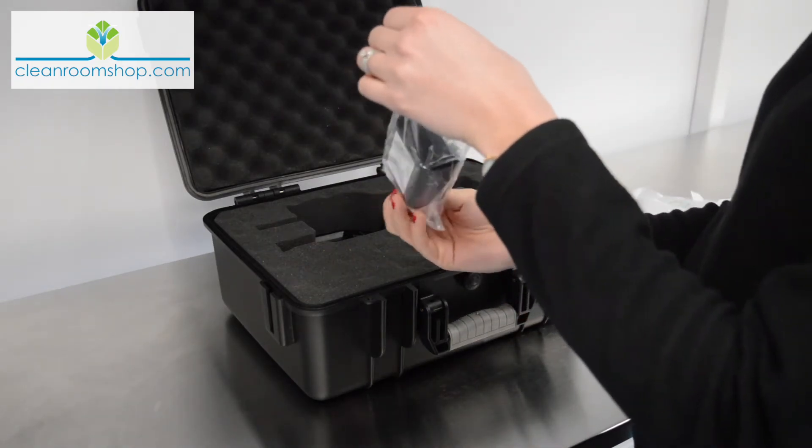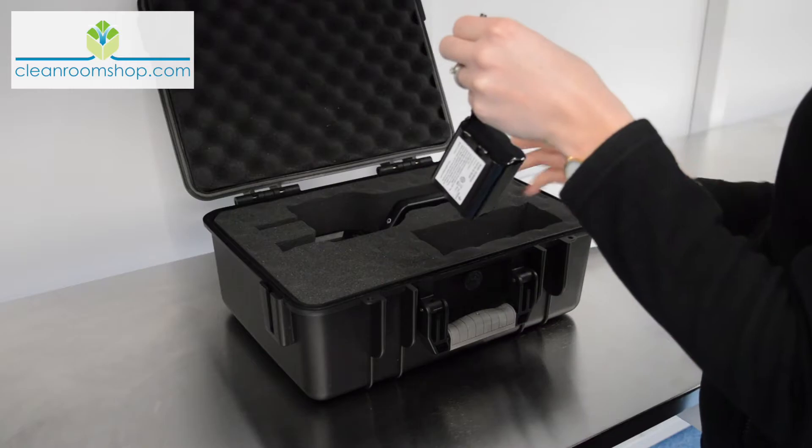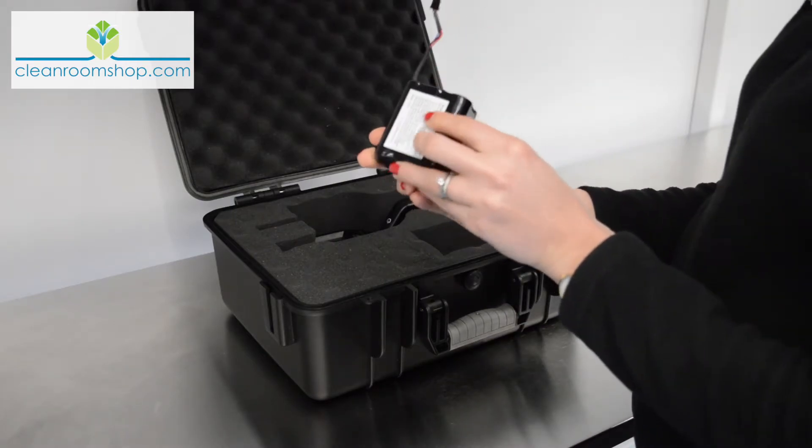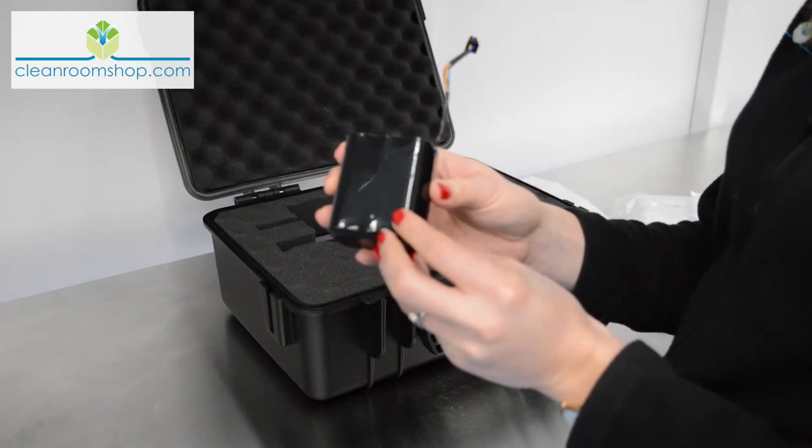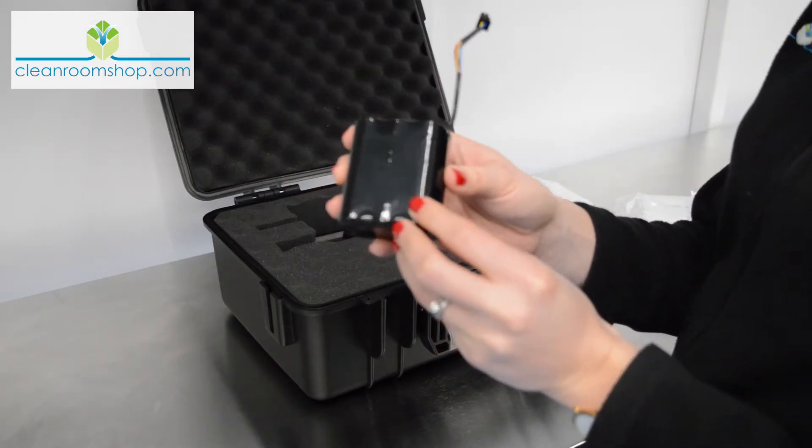Here's the battery. This makes it a true roaming device. It's packaged separately to help preserve its life. The power can run from the mains or from the battery, so you can use it however you wish.